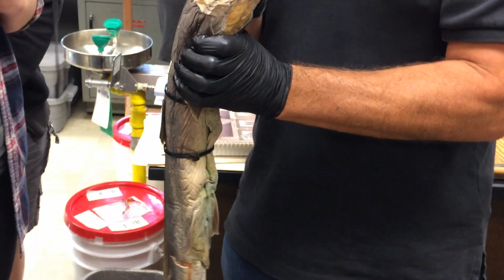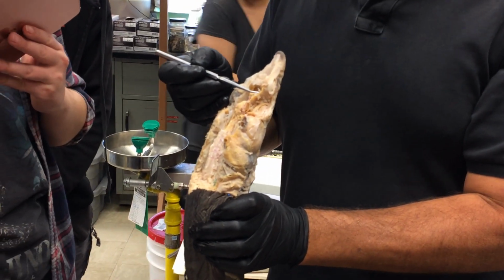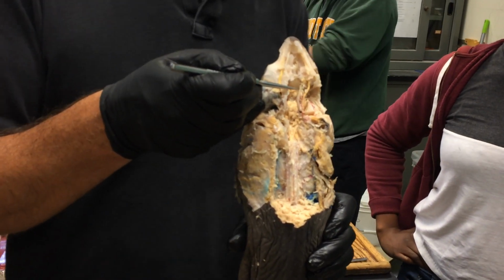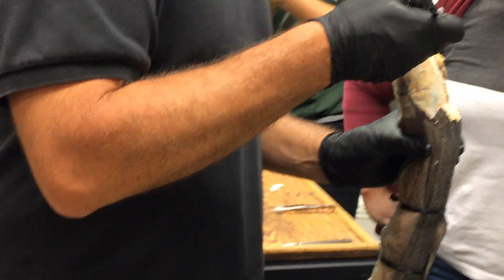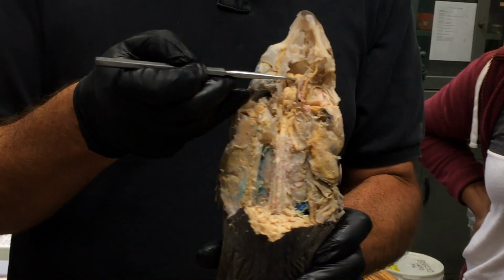And then running back from the olfactory bulb to the rest of the brain is the olfactory tract. And maybe if I hold it this way, that would be more convenient. Right there. So that's the olfactory tract. You see that okay? I know these things are a little small, but there they are. That's the olfactory tract running back. And then this is the cerebral hemisphere right behind that it's connecting to.